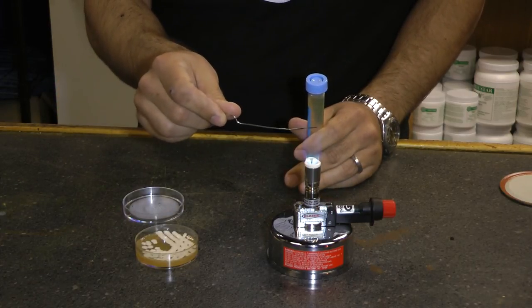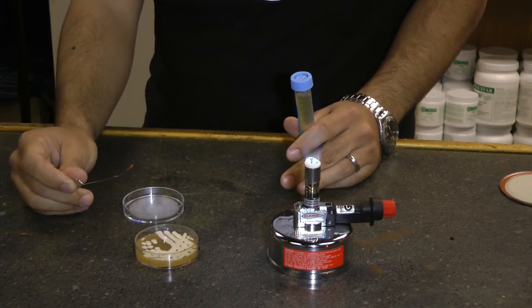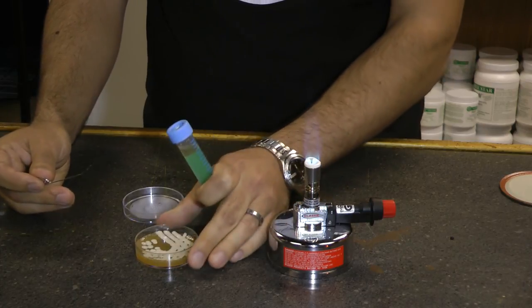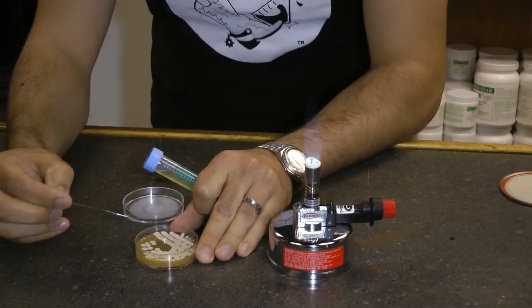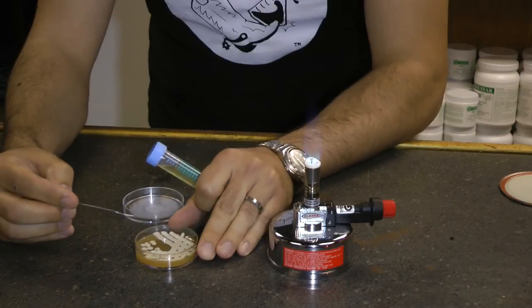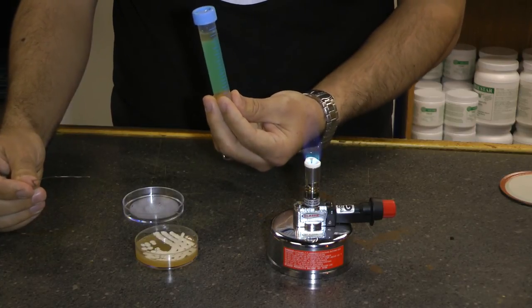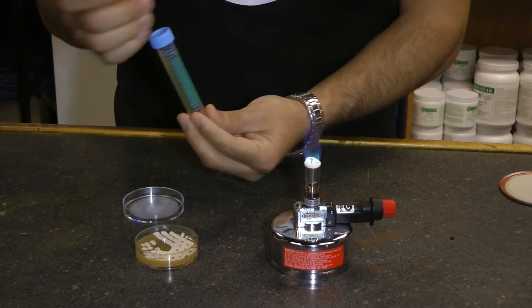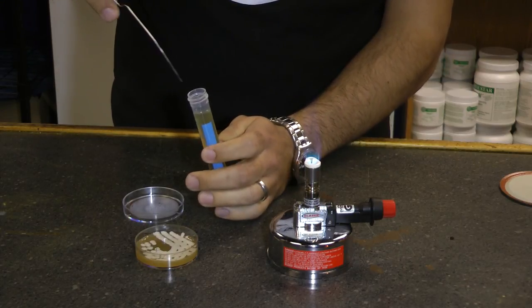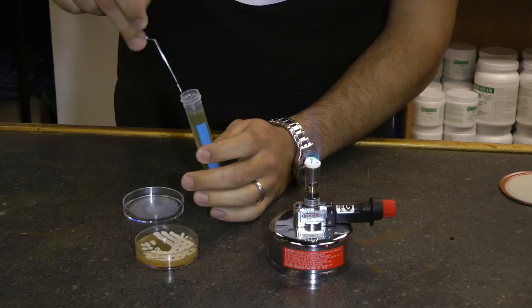So start off by sterilizing your paper clip — get it nice and red and hot. You've killed anything that's on it. Let it cool for a moment. If you get antsy and don't let it cool, you're going to end up just killing your yeast. Find a colony that's by itself and not touching anything else, and then just take a little bit. Really just the small amount that fits on this paper clip is all you need.